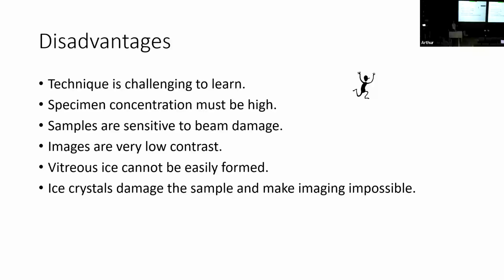And if you can't get vitreous ice, ice crystals are going to damage the sample basically and make imaging impossible. So you have to master it. There's no option.